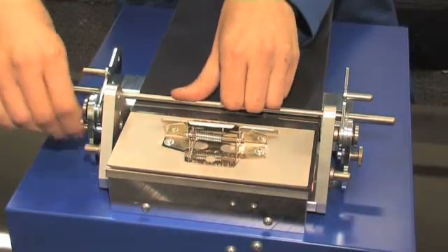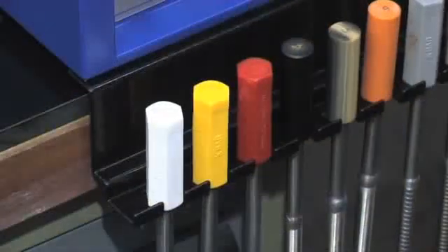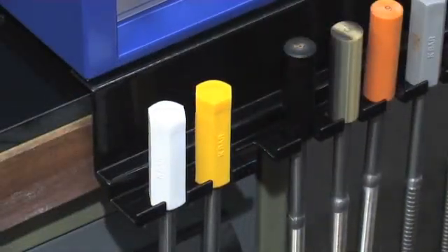The unique method of pressure control assures accurate and repeatable samples. Selection of the correct K-Bar is simple with their unique color-coded handles.